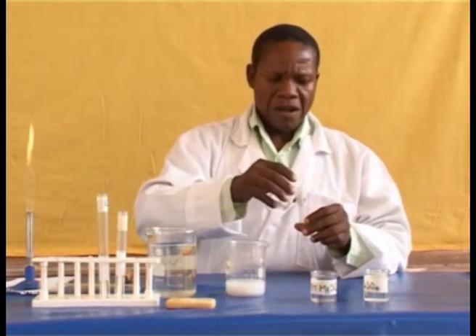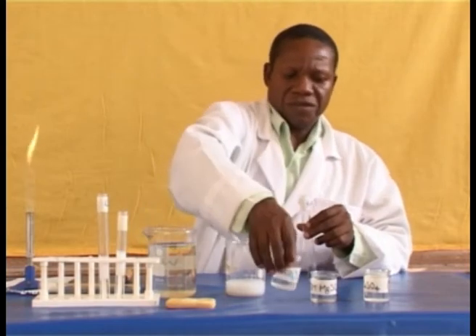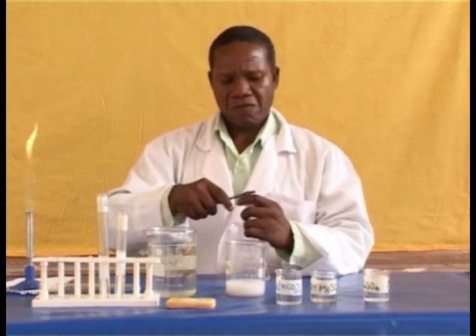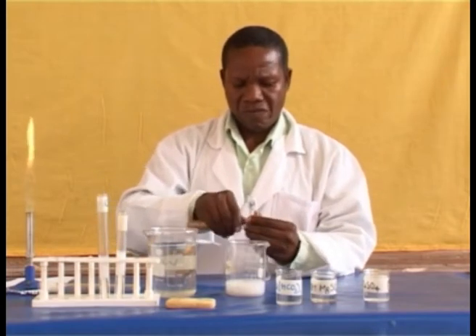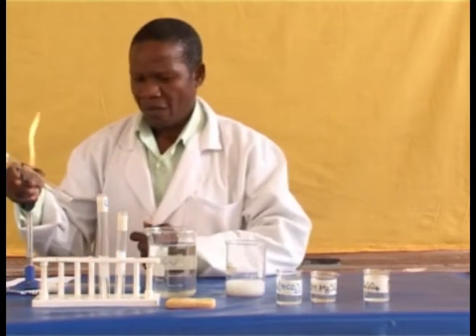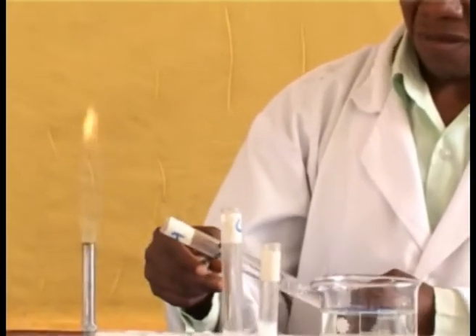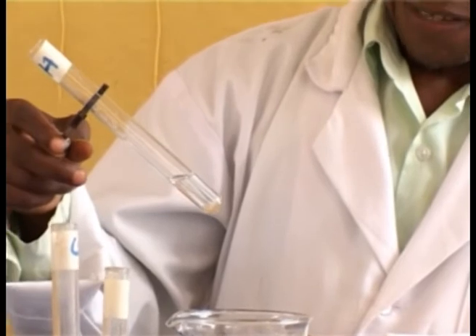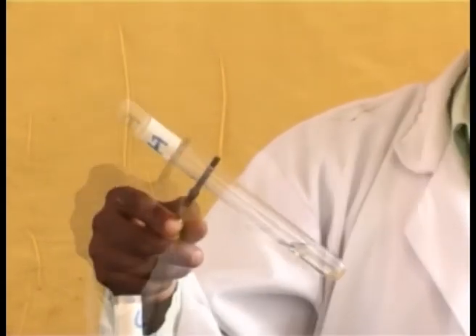Take test tube H, pour calcium hydrogen carbonate solution. During boiling, there is a very little precipitation of white substance. Cool this.